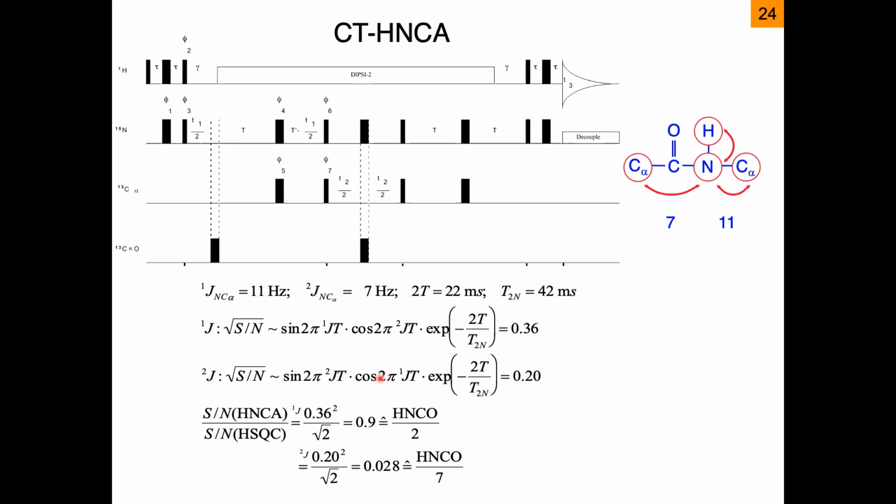You always get 2, and you need to make a compromise. And a good compromise is about 11 milliseconds for half of the delay length, what is capital T time.